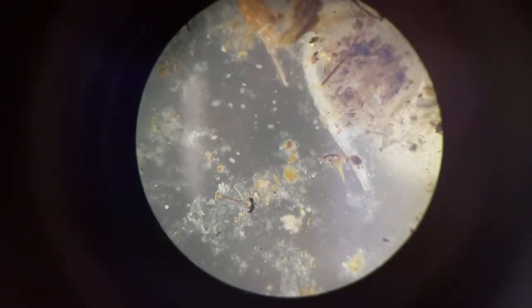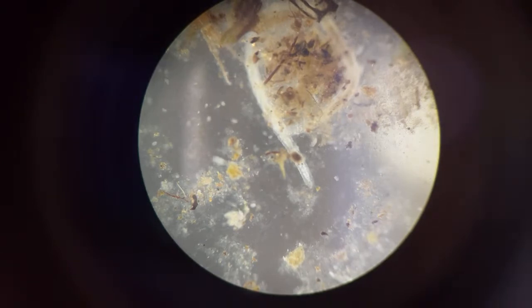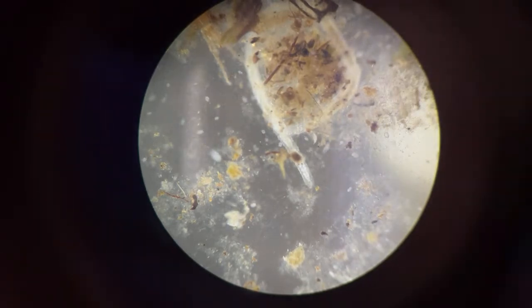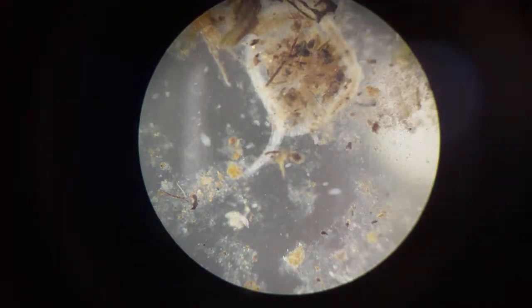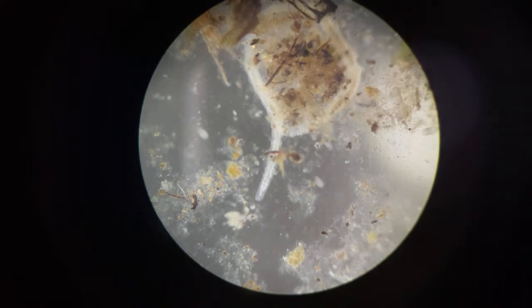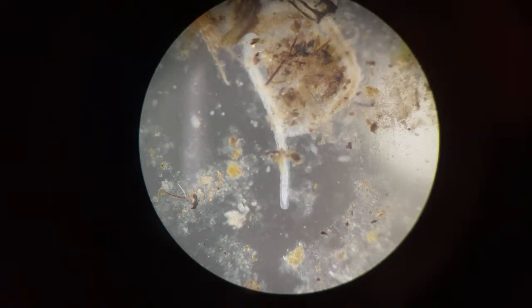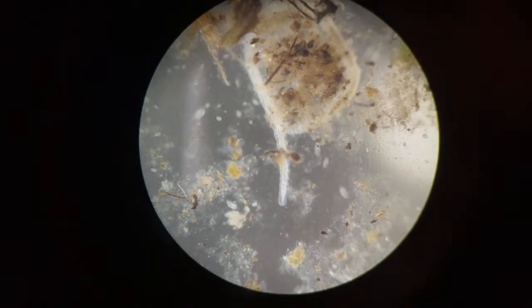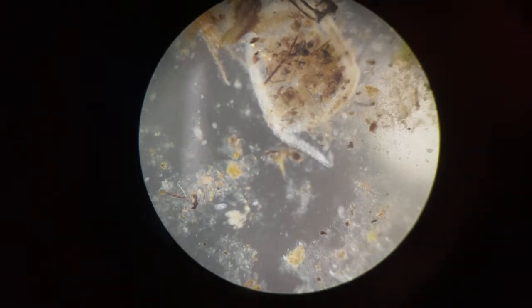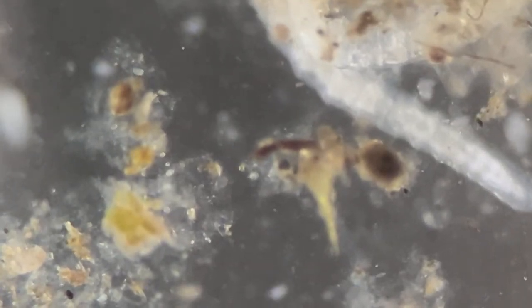So this little thing that we have, I'll draw the curtains. There is a white streak of light from the top side, which I'll try to somehow rectify.